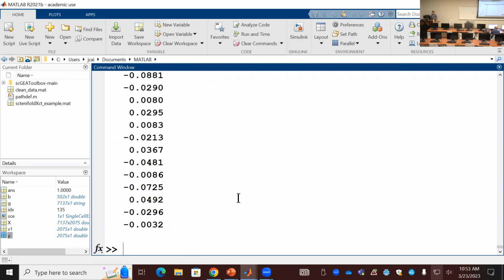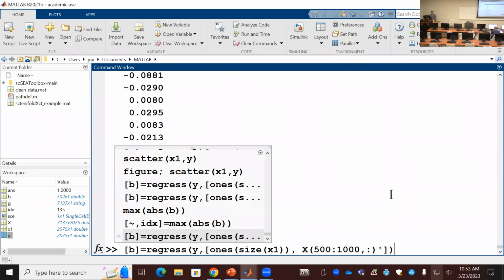I hope you know the difference between them. When I select genes not including 134, then the beta values start to show up. If I include that particular variable in there, everything can be explained by that 134 variable, and others will become 0.